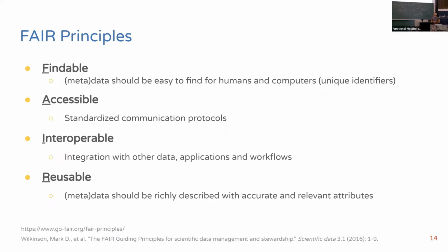Most of these workflow managers use the FAIR principles. We have heard about it several times now, so I will quickly go over that. Of course, the metadata and the description with relevant attributes is very important, but especially in that case, it should be accessible with standardized protocols. So you should use file types that are not very extraordinary, that most of the tools can read, and also interoperable. If you have a snippet of your workflow, it should be possible to use it easily in another workflow or in another application.